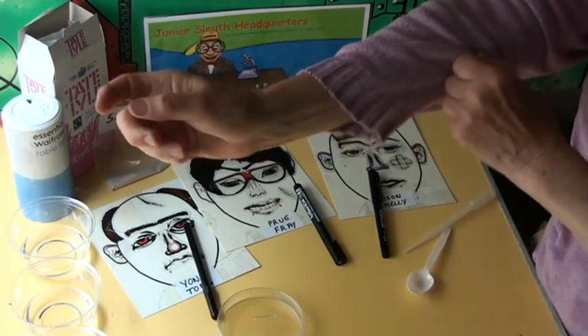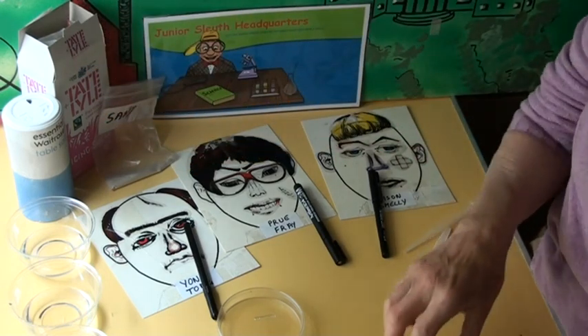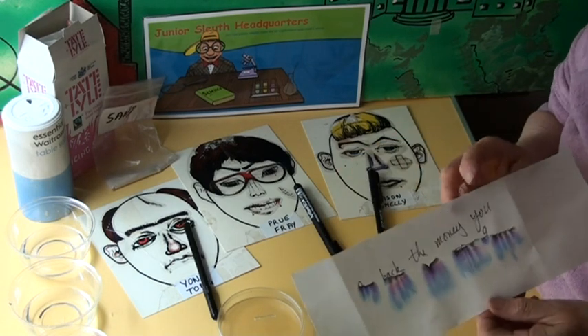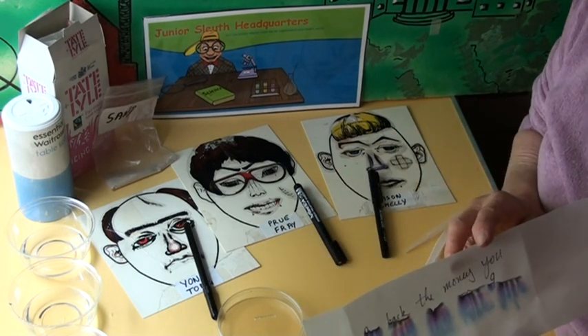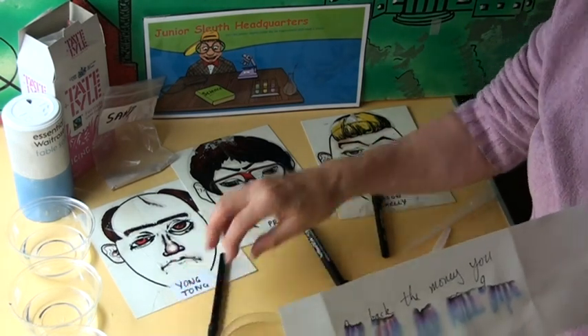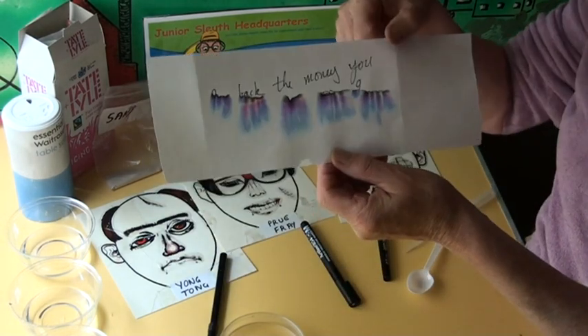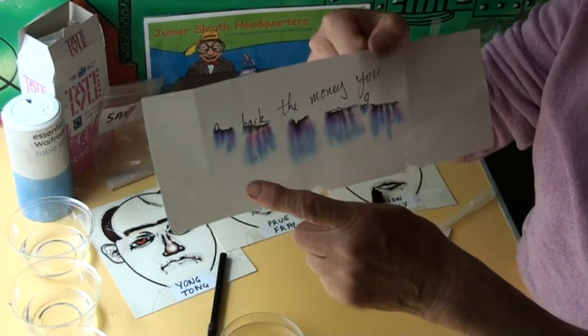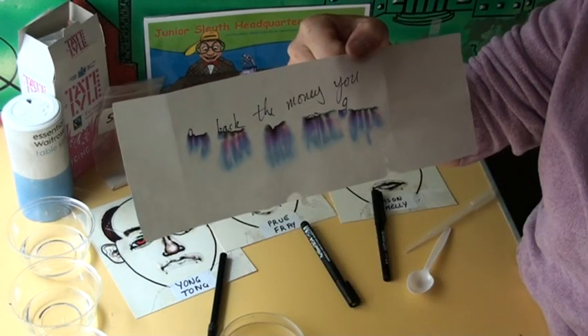My name is Anne Gray and I would like to show you an experiment. Today's experiment is all about a murder note. We're trying to solve a murder, and children love that sort of thing, but we make a story behind it. The story shows this note was found on a dead body. It must have got wet when it was lying beside the body.